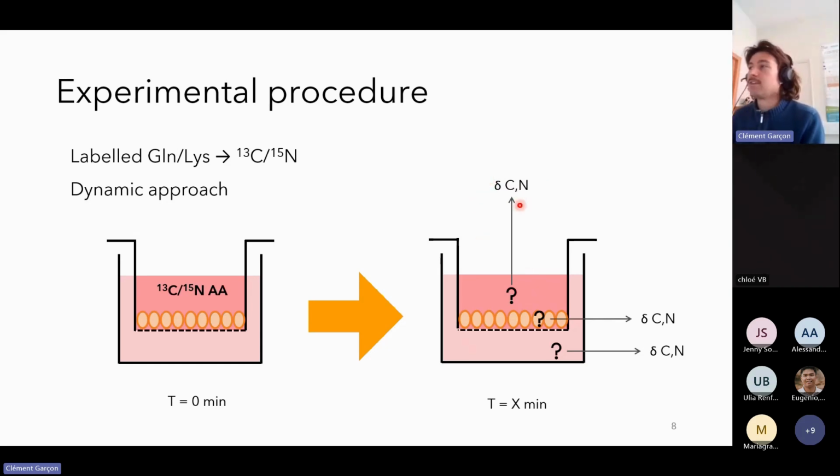So it's a value that is a bit complicated to understand because it's a ratio based on the international standards, but as it is for now, we mainly look at the kinetic and not the values by themselves. So for now, it's sufficient.